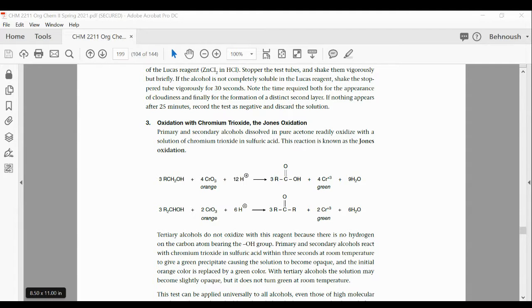And basically, experiment 19 is practice of working with and practicing reactions. It does explain a lot of reactions. It helps you a lot seeing the reactions with the evidence of the reaction. It helps you for your lecture. The only suggestion I have for you, you have a week of time. You can watch the video before you even start writing the procedure, because if we skip a part of the experiment, you don't have to include that in your lab notebook.